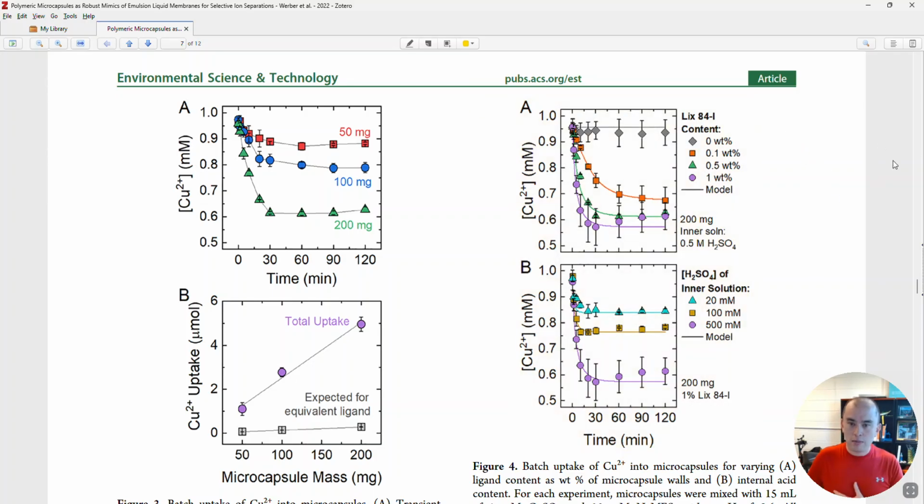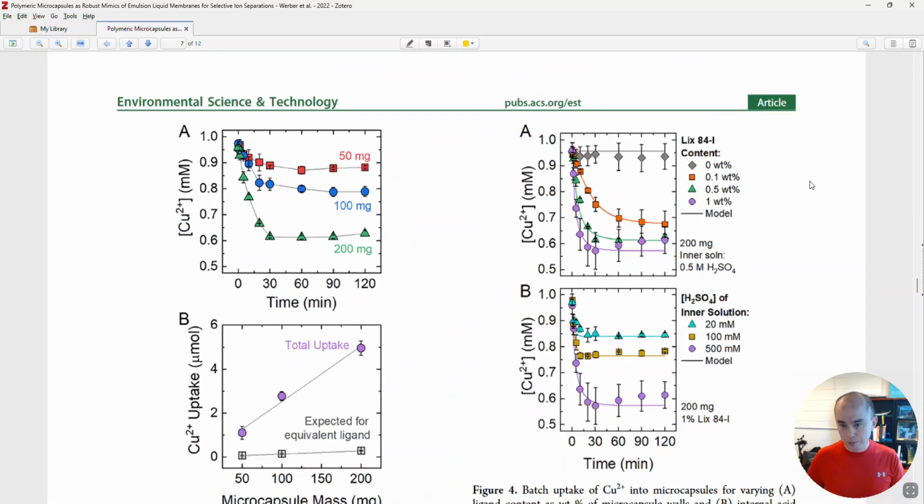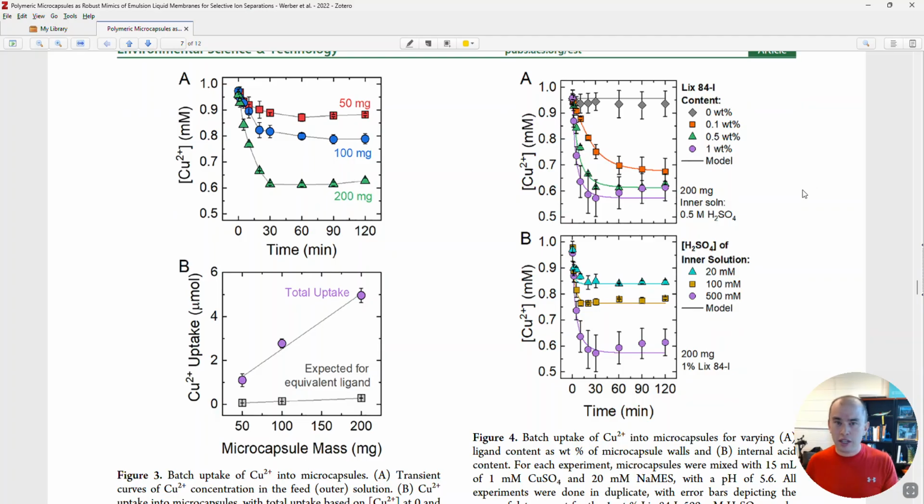So first off, you want to make sure that all the text is legible. So I just zoomed in, but really you want the text to be legible when it's zoomed out, something like this, when the page is the normal size that somebody would read when they're printing it out. So that's really important. Having basically as much information in the figure as possible, but still being really legible. You want the reader to be able to get information from the figure without having to go back and forth between the figure and the figure caption, and certainly not between the figure and the text, right? That's not really what you want.